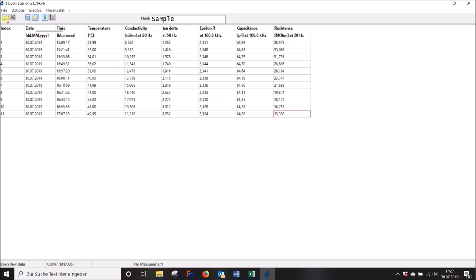Congratulations, your Epsilon Plus measurement has now been saved and you can now either close the program or start another measurement.